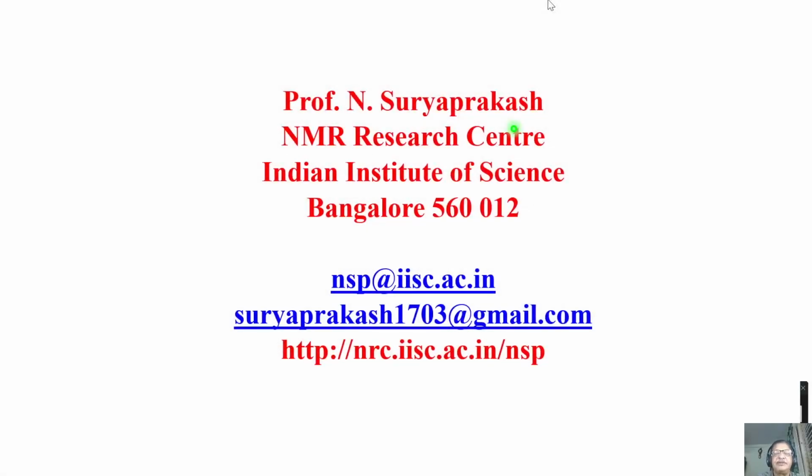In the last class, I started discussing carbon 13 NMR, where I introduced some salient features of carbon 13 spin. As I have been telling all along, the gyromagnetic ratio of carbon is 4 times less.